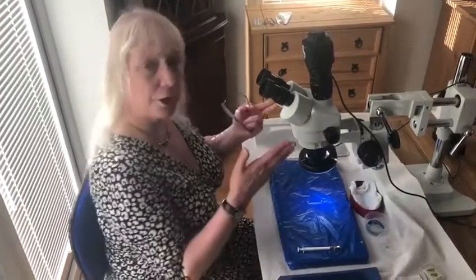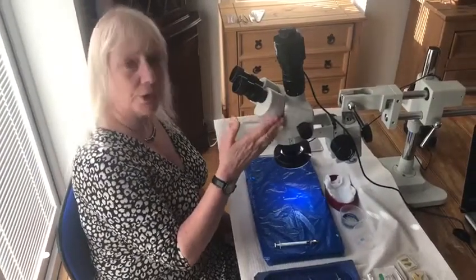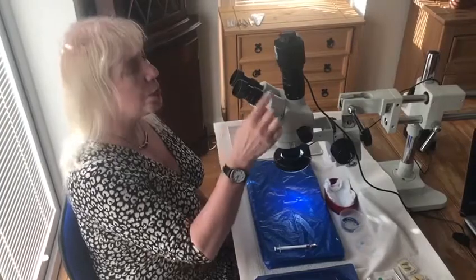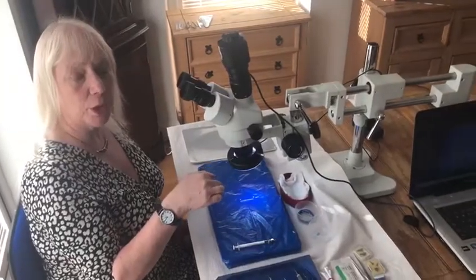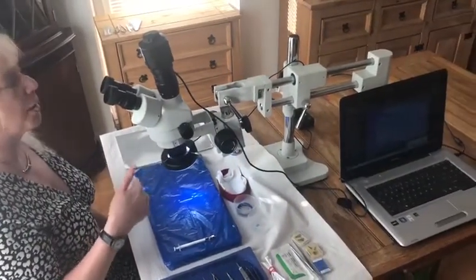Then you actually need your microscope itself. It doesn't matter what model you want to use, but make sure that you've got your zoom and focus and everything is in order. This Optimal microscope has got a camera on it and I can see from the computer what the person is doing when they're actually operating, but you won't need that if you're just setting up and operating on your own.